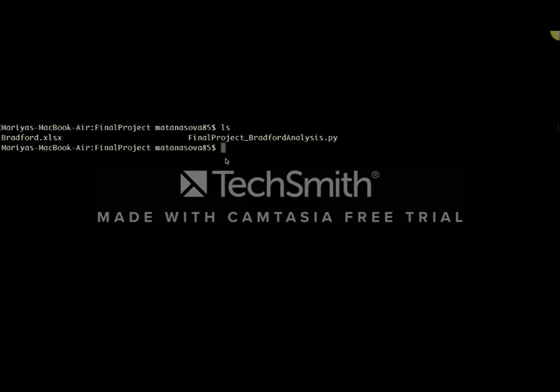So here is our directory where I have my Python program and a Bradford.excel file. So we're going to call Python, the program and the Excel file and run that.